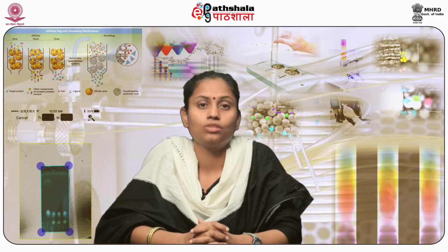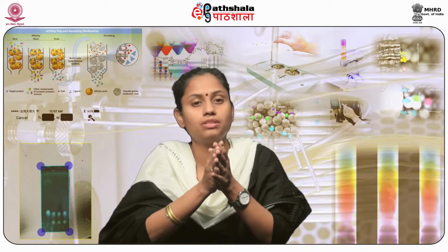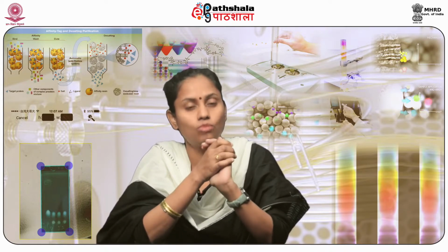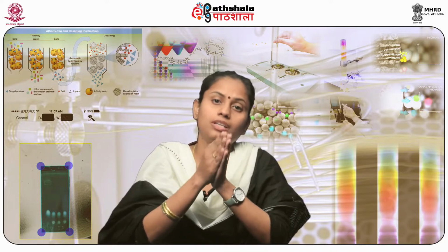So students, in the end, after going through the module, it is time to summarize what we have learned in this module. Ion exchange chromatography is based on the principle of separation on the basis of net surface charge of the molecules. There are two types of ion exchange chromatography which we have learned.